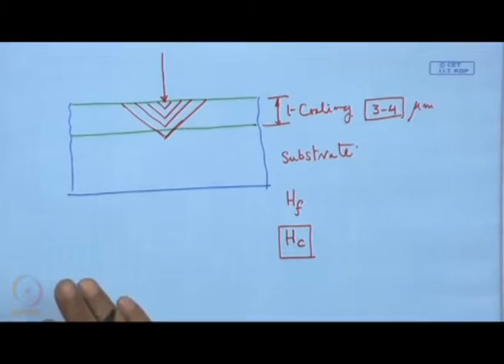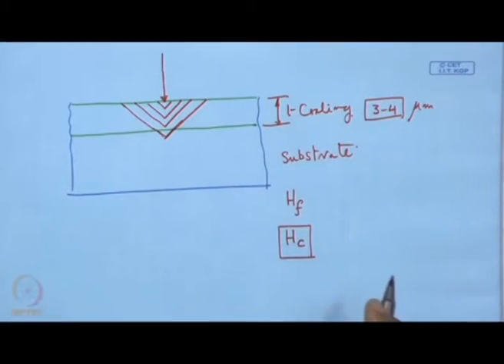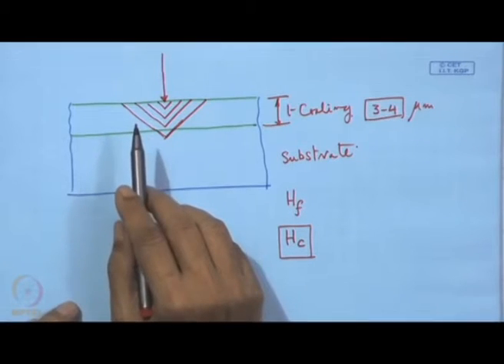So, obviously, it depends upon the thickness of the coating on one hand, and on the other it is the load, how much load is applied.